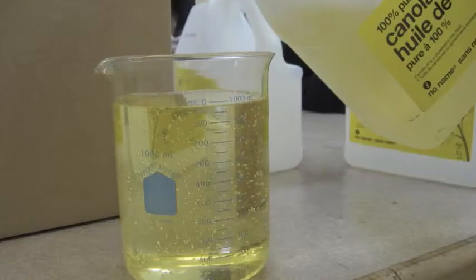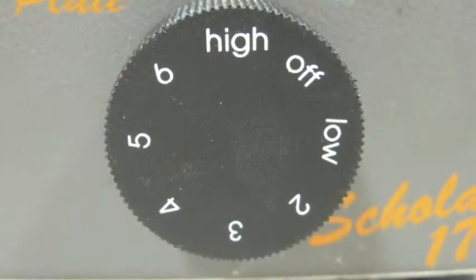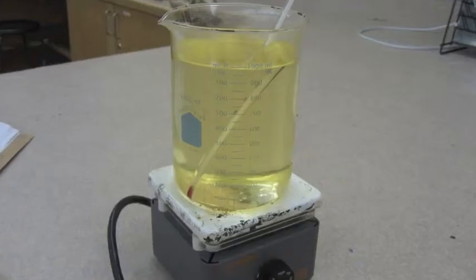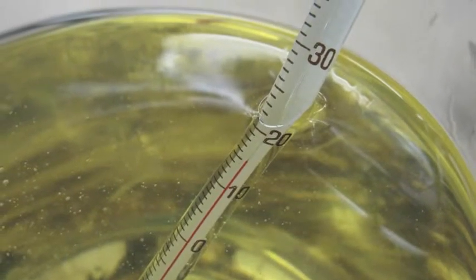Step 2: The second person should measure 1L of canola oil in the large beaker. Put the hot plate on high and place the oil on the hot plate. Place the thermometer into the oil and continue heating until it reaches around 50 to 55 degrees Celsius. Then remove it from heat.